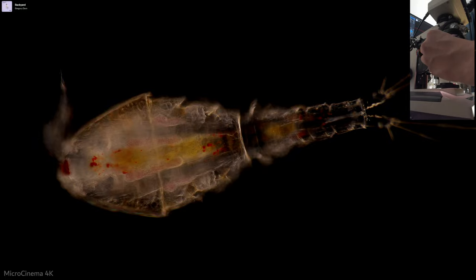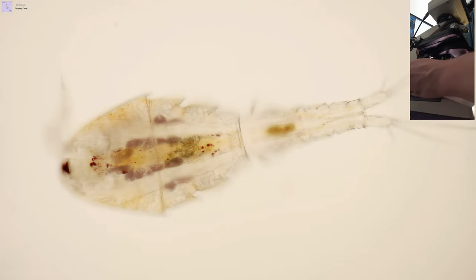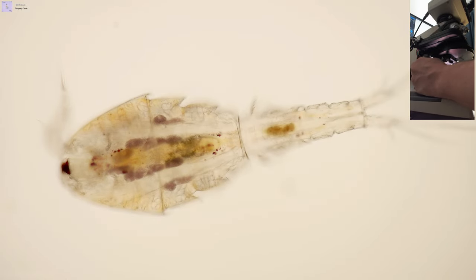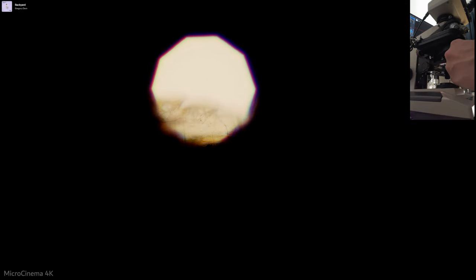I'm going to pull the... I'm going to push the polarizer back into place and I'll just get my iris back here and then I'm just going to realign for Köhler since I had to lift up the stage a little bit. And it looks like we need to just pop this down a little bit like that.